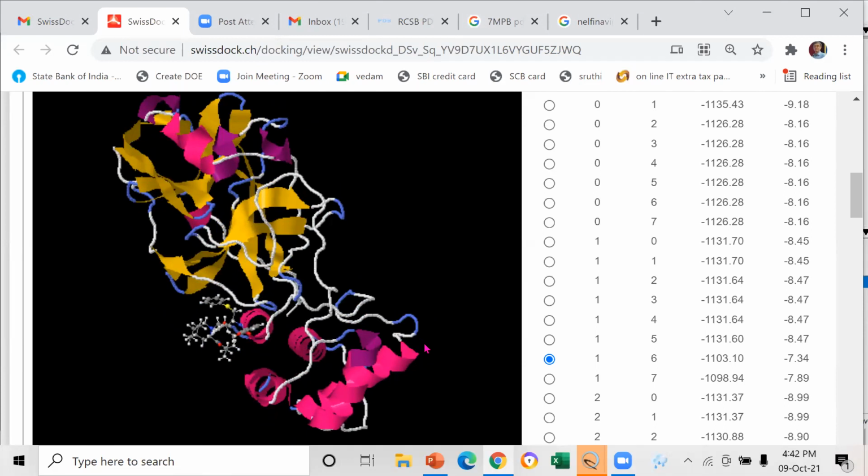So you have the first step, the homology modeling. That means you compare sequences and then take the best template, and then you build your model and check whether the model is good, and store it. Then you go to UCSF Chimera, and you can add hydrogens, remove solvents, minimize the energy. You also have to cut down on the size, because many software take only 15,000 atoms. So make it smaller and then store it again. That you use for your docking.